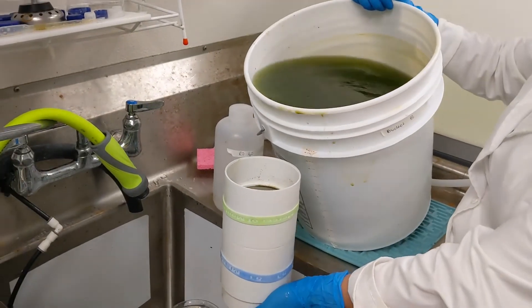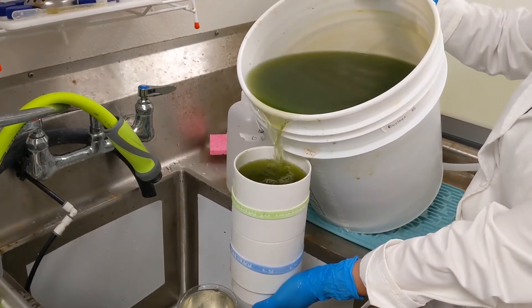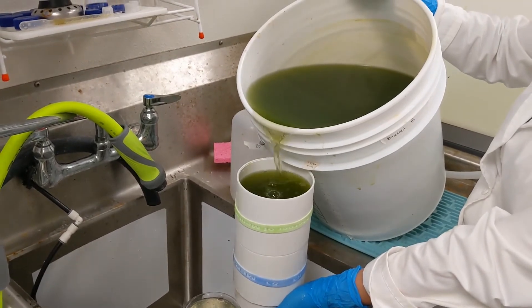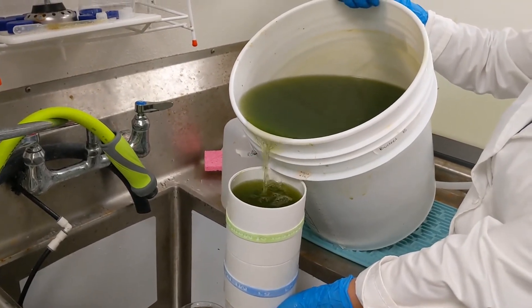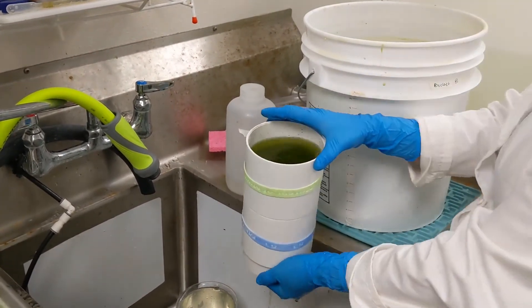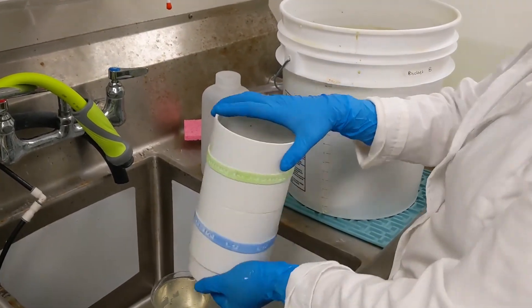To collect the rotifers, we dump each bucket through a 120 micron filter and a 50 micron mesh. The 120 micron mesh collects any algae and debris, and the 50 micron filter collects the rotifers. Removing this excess debris helps to keep the ammonia down.